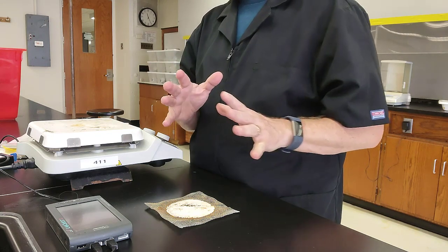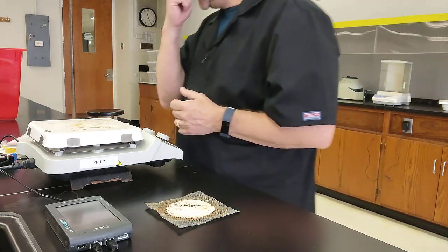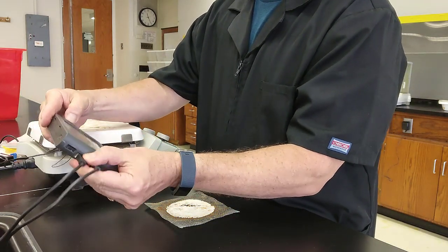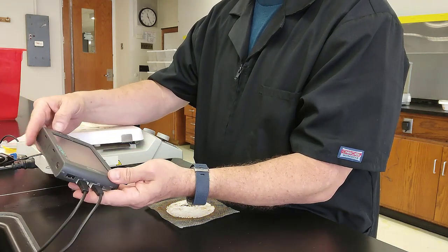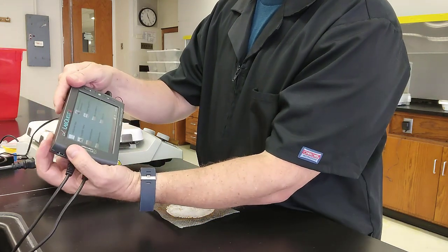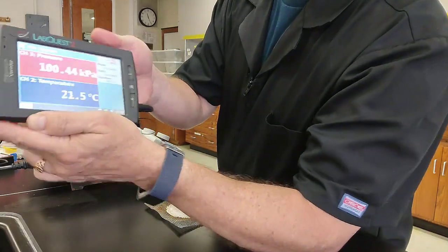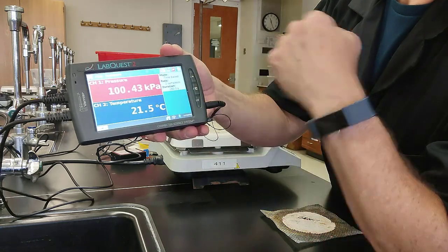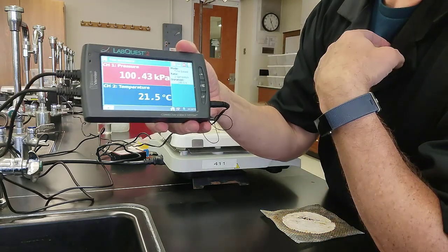So, the first thing we're going to look at is the examination of pressure and volume, which is Boyle's law. To do that, we're going to get our old pal, the temperature LabQuest sensor here, which will also, depending on what we have plugged into it, measure pressure. So, turn it on. And it, as always, knows what we have hooked up to it, so it's reading a pressure in kilopascals, which is the SI unit and the default, and temperature in degrees Celsius.